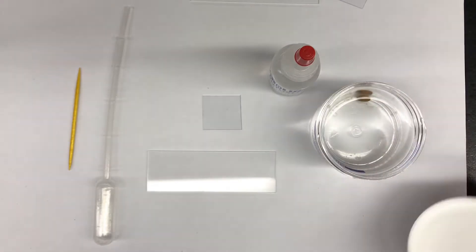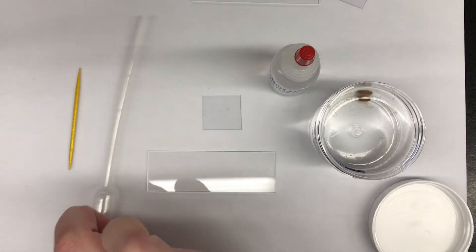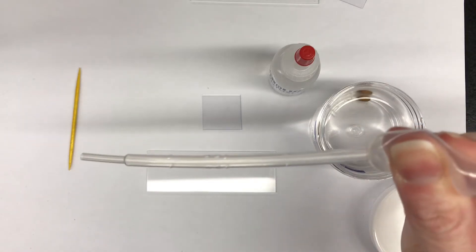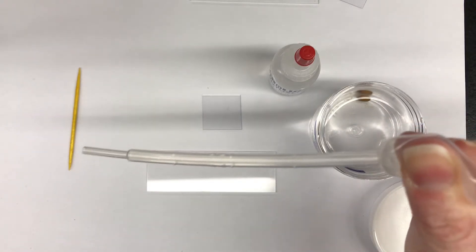You're going to take the lid off of your specimen jar, pick up your plastic pipette, and squeeze the plastic pipette before putting it into the liquid.